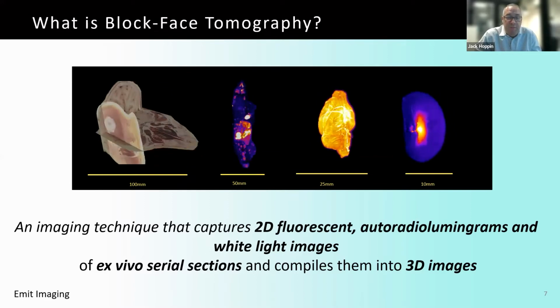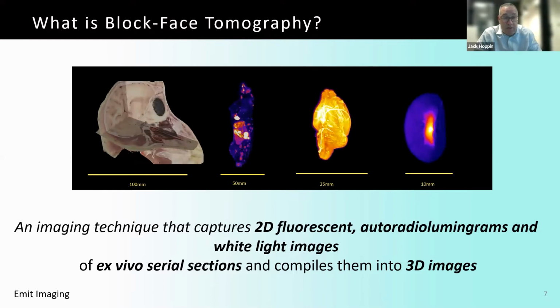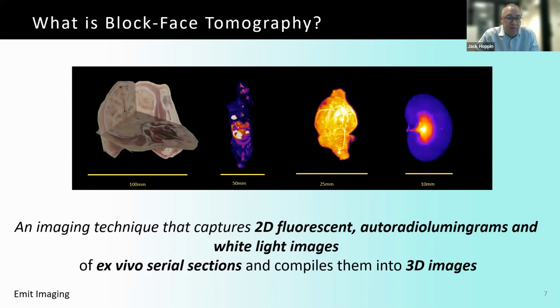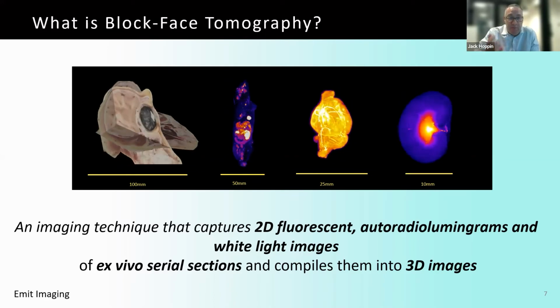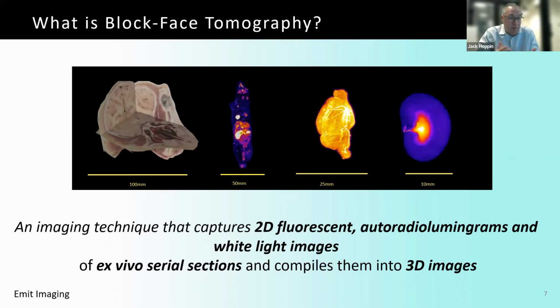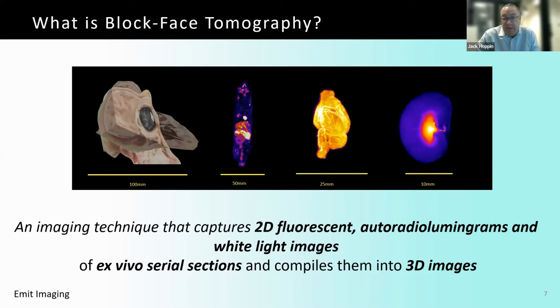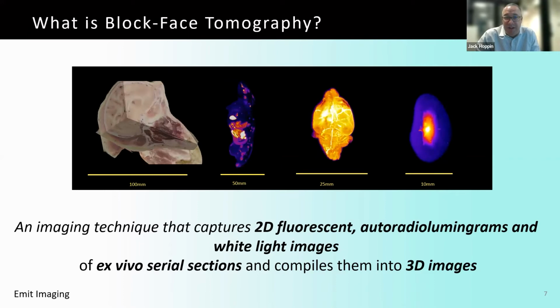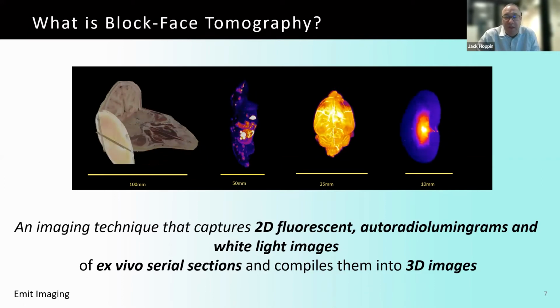In that study, we also had a radionuclide on board, and we stopped every 10 sections and did autoradiography and built a 3D image. I don't show that image here, but it was a very telling study. And this was a kind of a breakthrough to be able to see this anatomy, in this case, pretty painstaking and tedious work, but very important and really helpful.